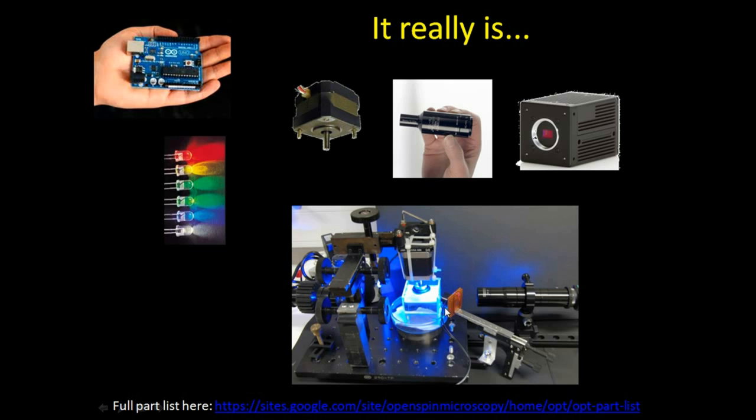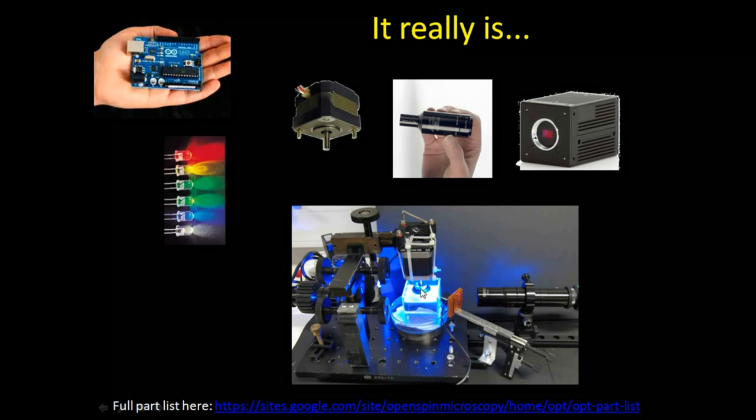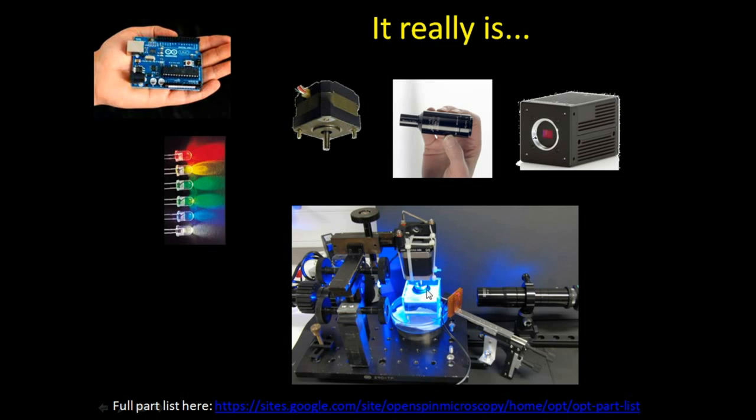So quickly to describe what you're looking at here, this is a motor, a stepper motor, and this stepper motor is connected to a magnet which can hold the specimen suspended inside this oil bath. Now this oil bath actually has inside a mixture of benzyl alcohol and benzyl benzoate, known typically as BABB, B-A-B-B. BABB or BAB has been around for quite a while.